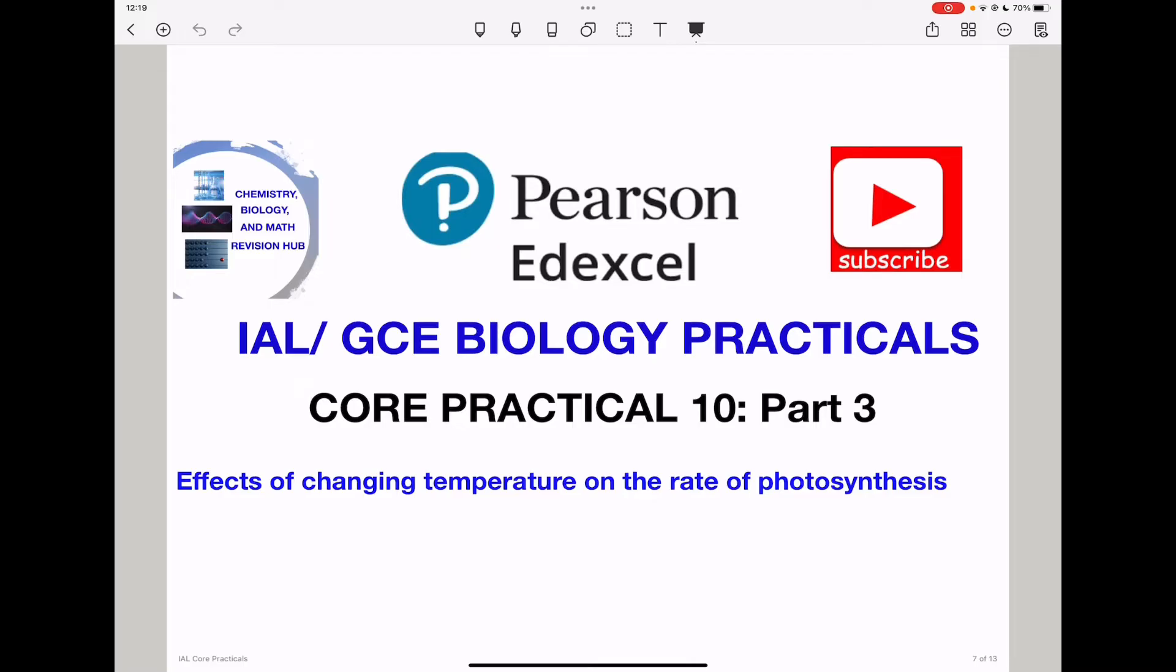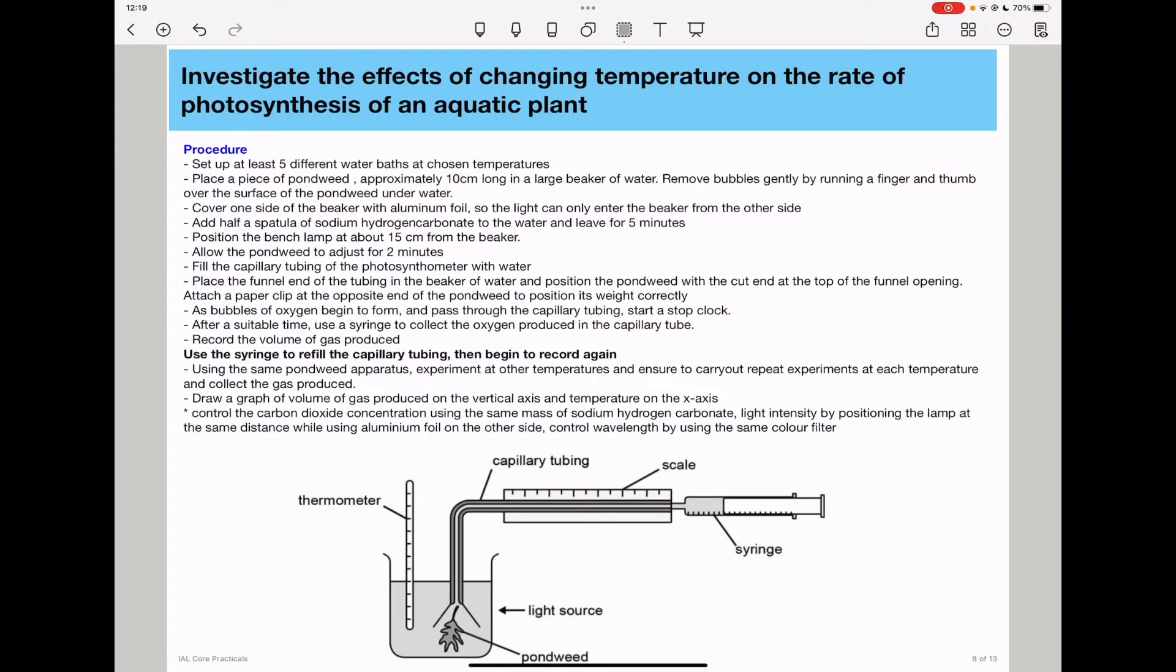The experiment studies the effects of changing temperature on the rate of photosynthesis. Let us begin. Investigate the effect of changing temperature on the rate of photosynthesis using an aquatic plant.